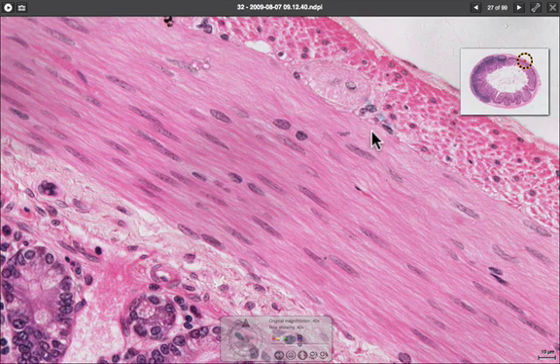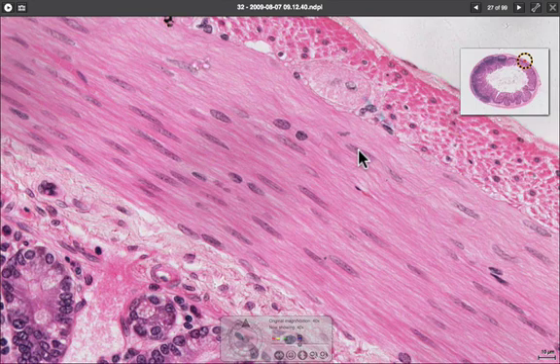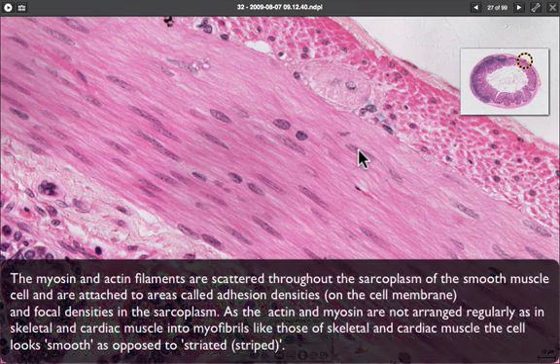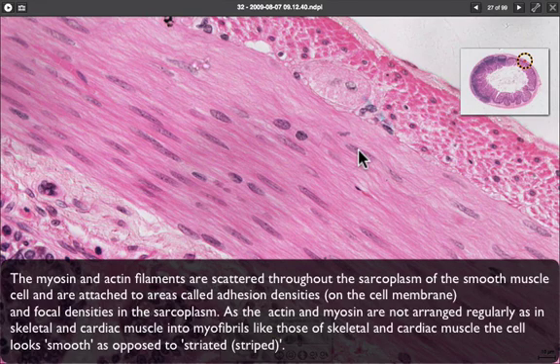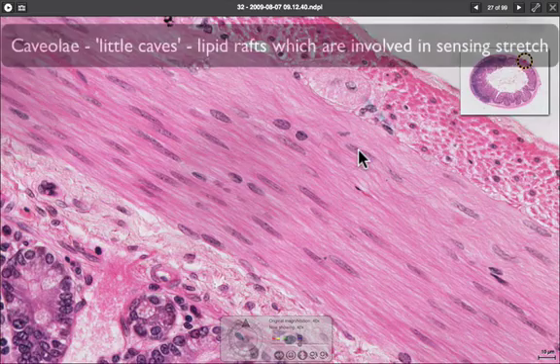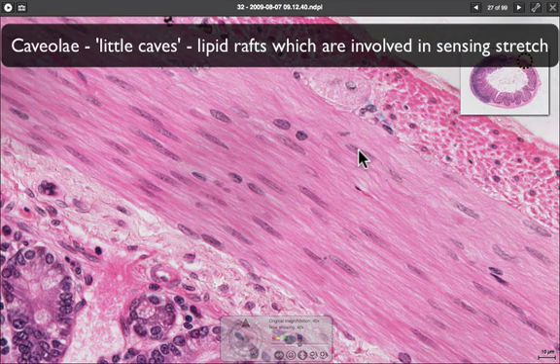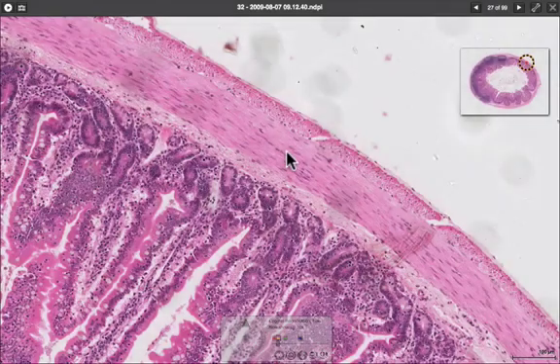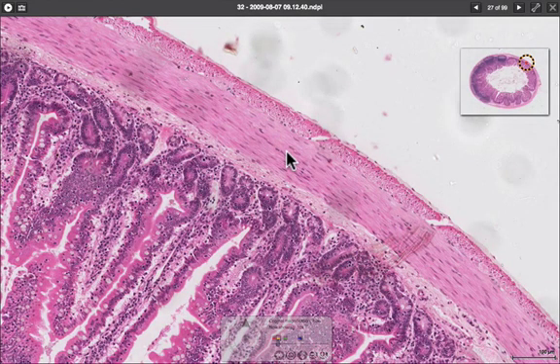Using an electron microscope image, we would be able to see the contractile filaments and caveoli in the membrane surface, which allow the passing of signals from one cell to another.